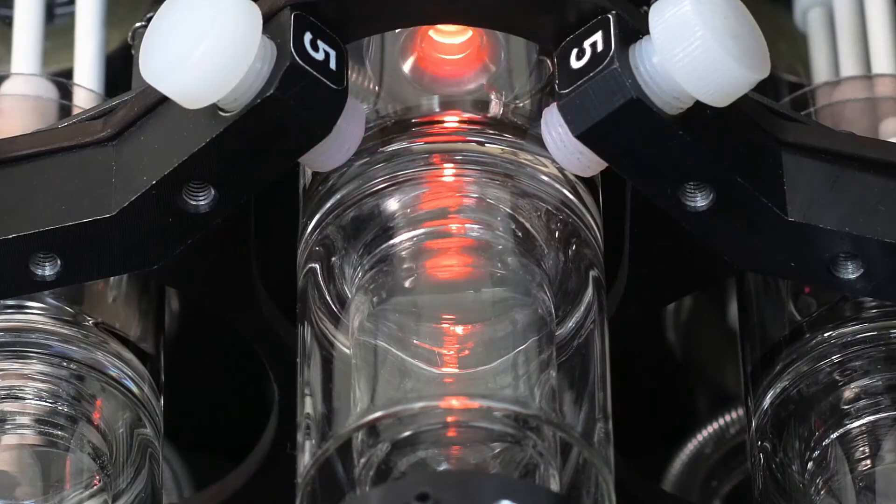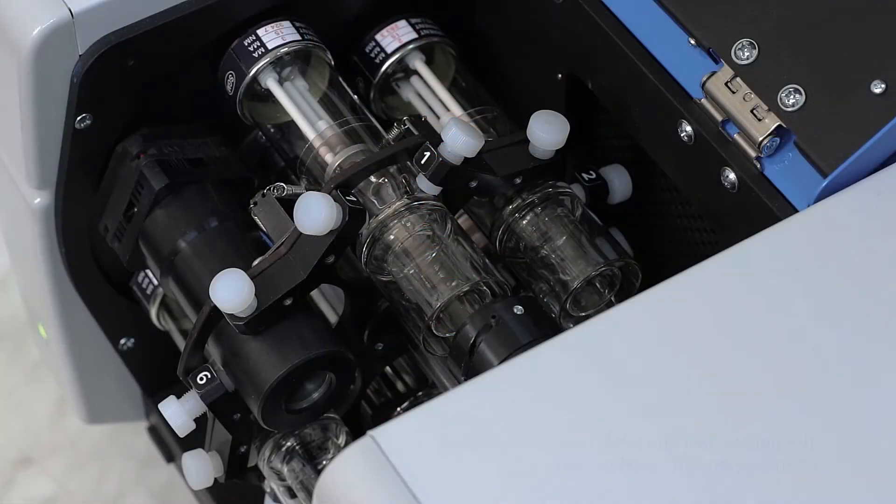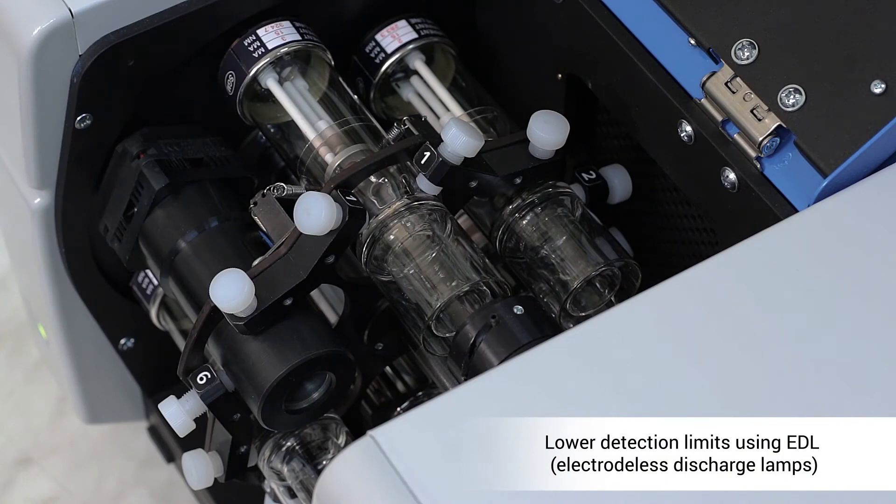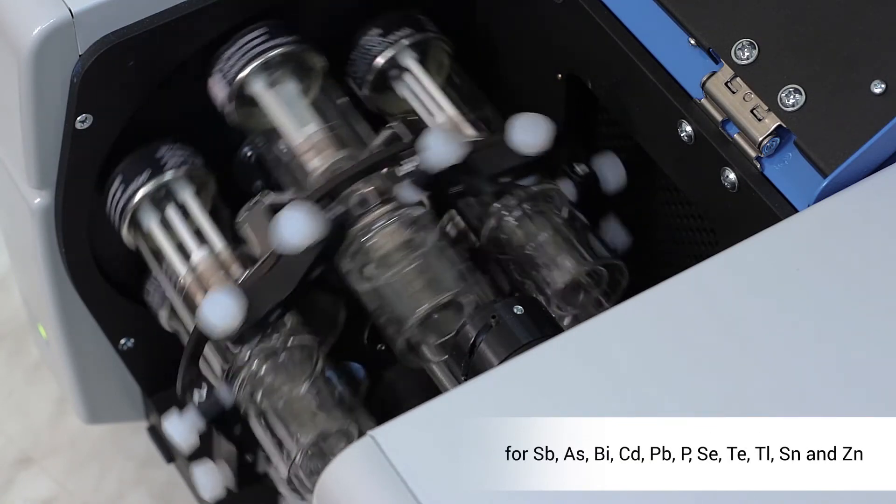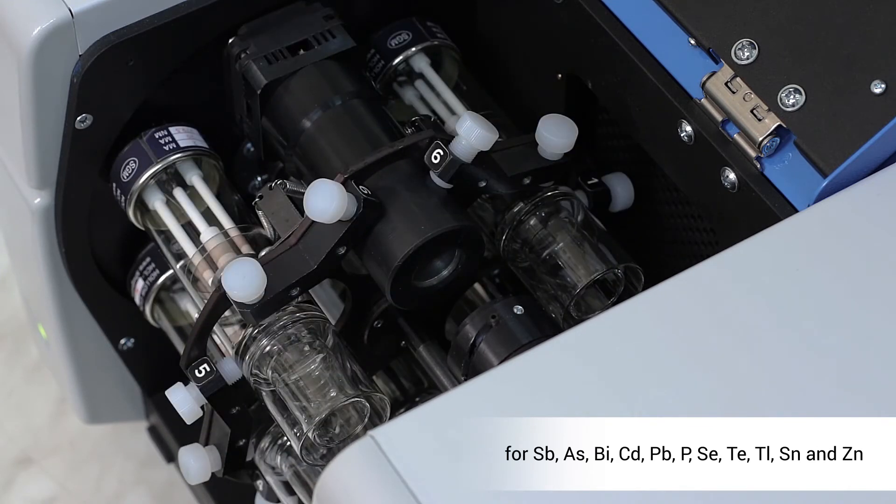The instrument works with both traditional hollow cathode lamps and high-intensity electrode-less discharge lamps. Using EDL improves detection limits for certain elements, such as antimony, bismuth, cadmium, lead, phosphorus, tellurium, thallium, tin, and zinc.